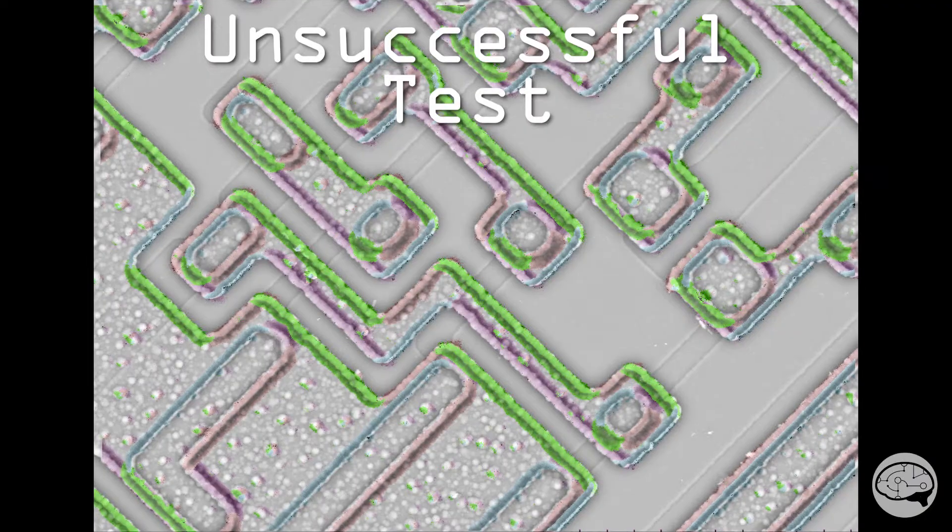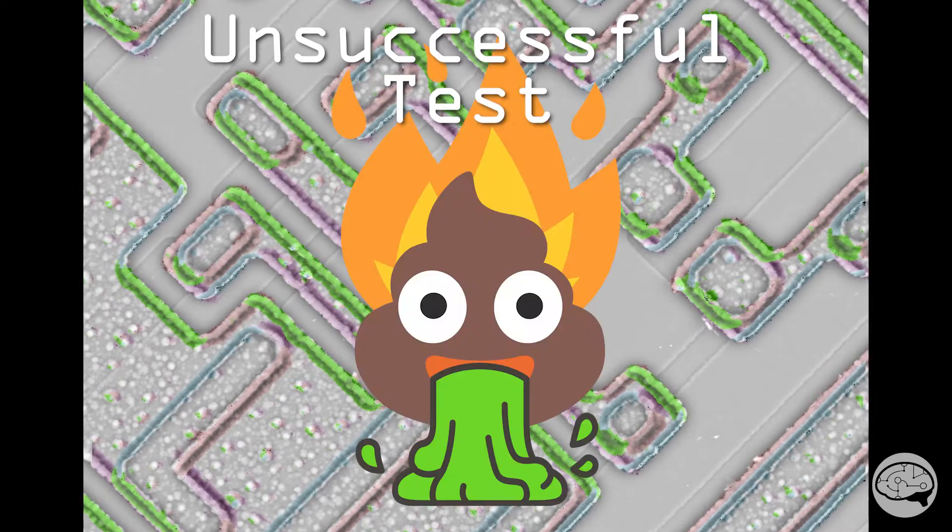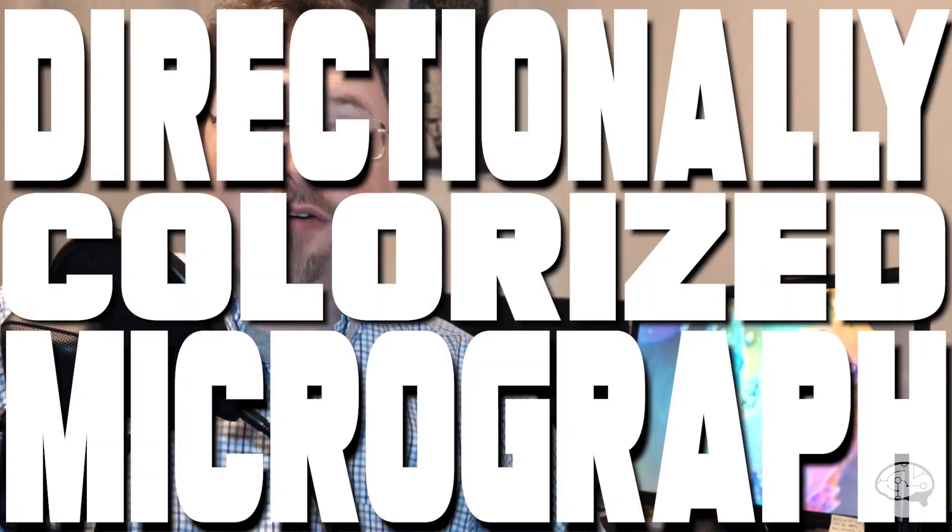As I pondered the problems of how to easily colorize images in the SEM, when this older technique of attaching extra detectors gave me an idea. I don't have extra SE detectors to throw around, but I do have a BSE detector with multiple segments. These BSE segments allow you to get multiple directional or shadowed images in the SEM. After a few unsuccessful tests, I was eventually able to find a good method for combining multiple images from different segments of the BSE detector to create a directionally colorized micrograph.